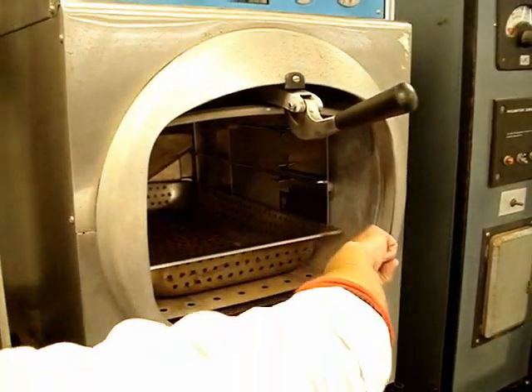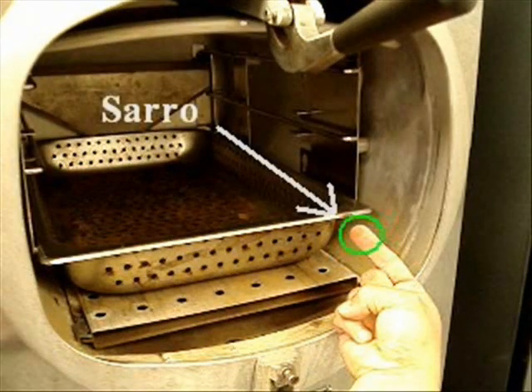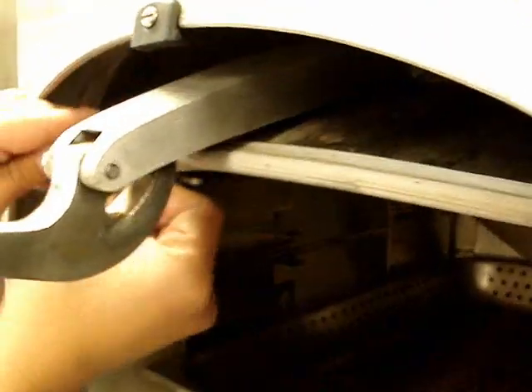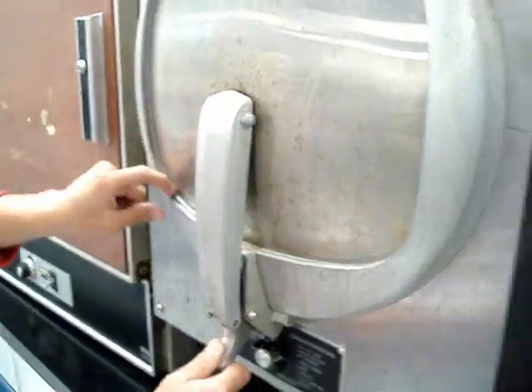De vez en cuando se le debe dar mantenimiento al autoclave. Inevitablemente, a pesar de usar agua destilada, siempre se acumula sarro en las paredes. Para remediar esto, se utiliza una solución de ácido acético al 5%; se calienta el autoclave y se enjuaga un par de veces con agua destilada. Esto se realiza cada 15 días según sea el uso. También se debe revisar que los empaques estén en perfectas condiciones, que sean flexibles y sellen herméticamente; se deben cambiar cada 6 meses o cuando se pongan rígidos.